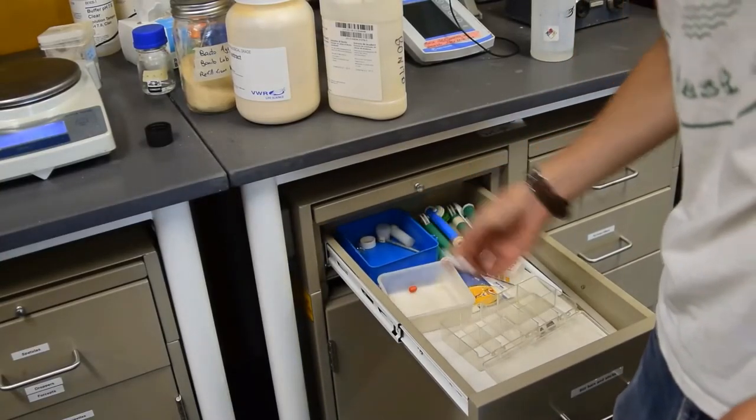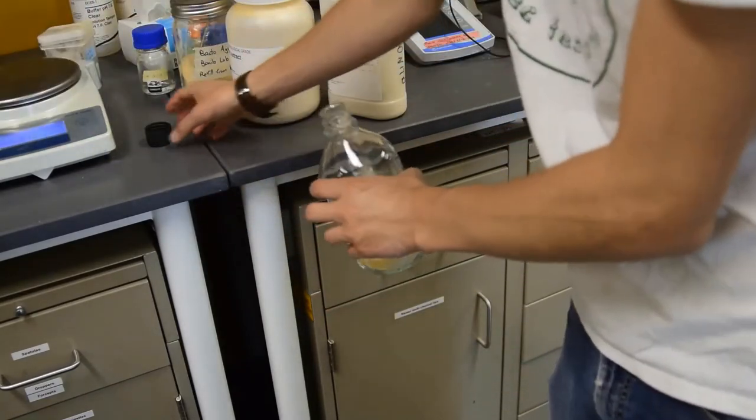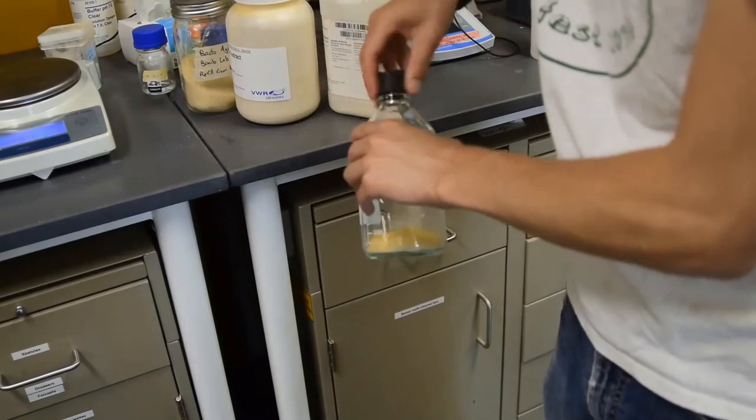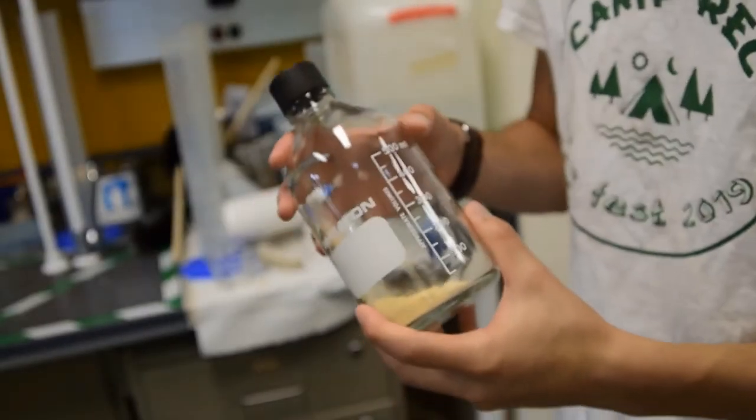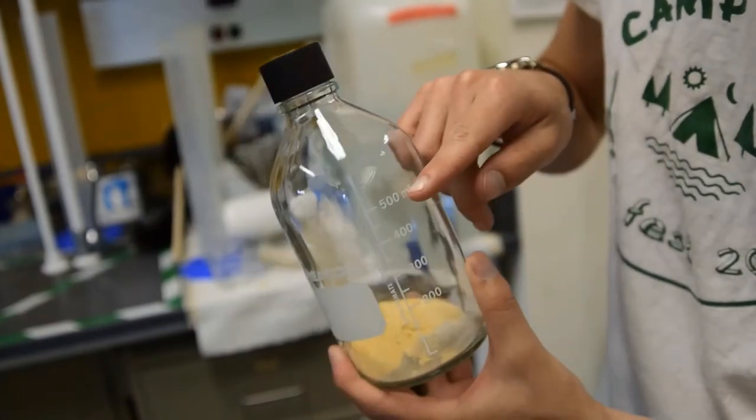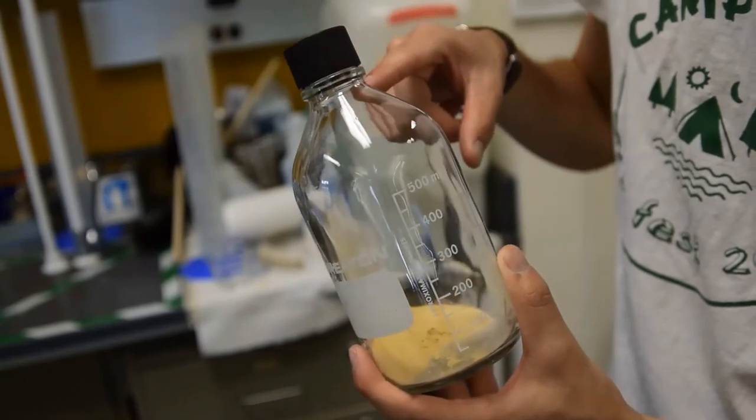Now we're going to need a magnet, which can again be found under the bench. This is used to help stir the solution in a sterile manner. Now we need water. For these bottles, we don't want to fill them above the 500 milliliter line because that makes them more likely to spill over in the autoclave.